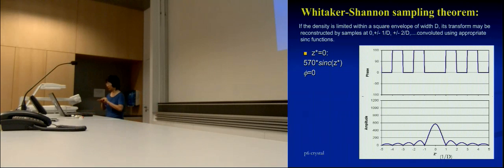So that's that. I will clear on that part because I'm going to move on to something different. Okay. So that's defining the envelope function. Now I'm going to go a little bit on the one theory that affects how they do this parameter fitting.